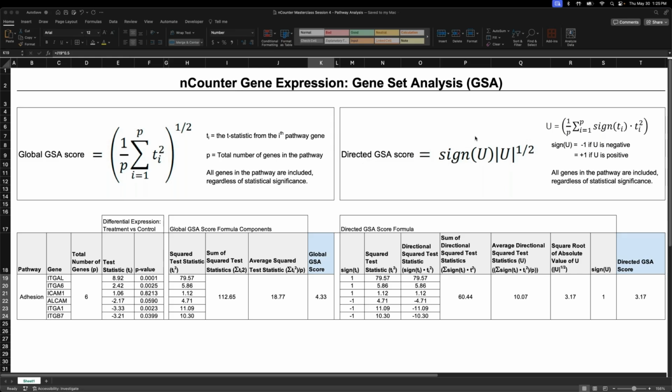So let me break this down in a little more depth. Now this gets a little crazy over here to interpret, but just bear with me. It's the same thing as what we just looked at, but now what we're incorporating is just the positive and negative signs: positive for upregulated, negative for downregulated. So the interpretation should be very familiar to what we just looked at. So let's break this down in the math. I'm going to try to go through this slowly. Hopefully this is making sense for all of you.